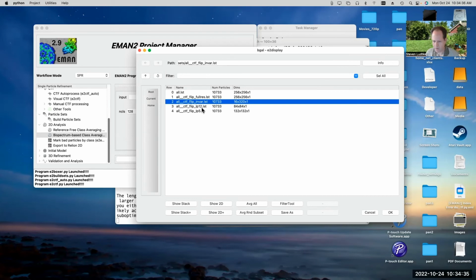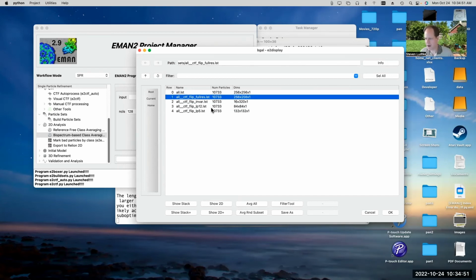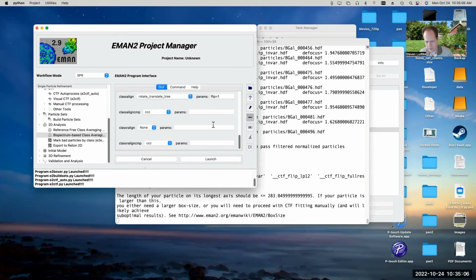So I'm going to go ahead and run this on the, we're not going to wait for this today anyway. I think it won't take a long time to run, but it's still going to take probably 10, 15 minutes or something. And we were already over an hour. So I'll go ahead and run it on the full resolution data, just so we'll see the bigger particles, because I don't care if it takes a little bit longer to run right now. And then we'll look at some of those results next time.